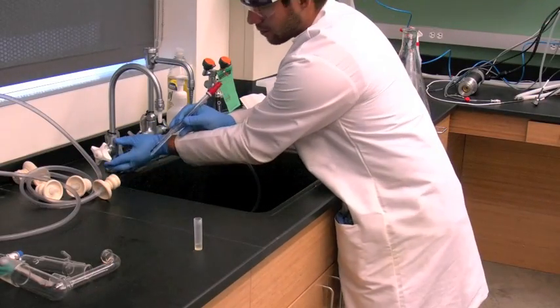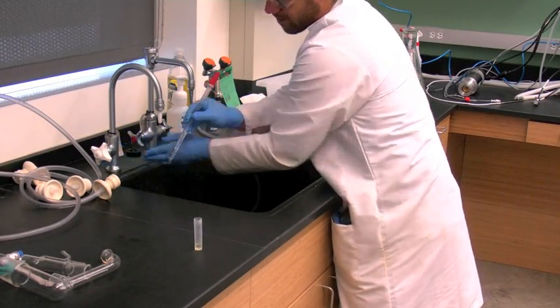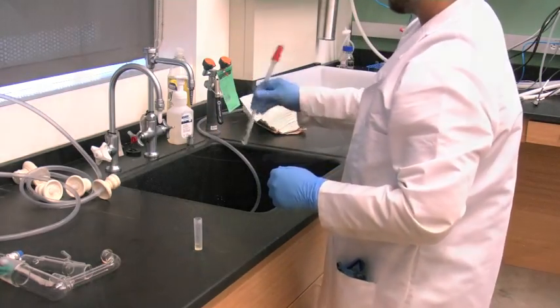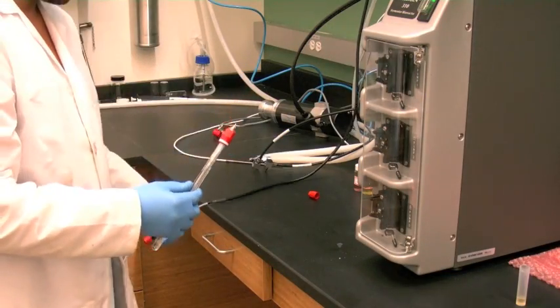Remove probe from 4 molar potassium chloride storage bottle and rinse with distilled water. Connect probe to PCU with cable.